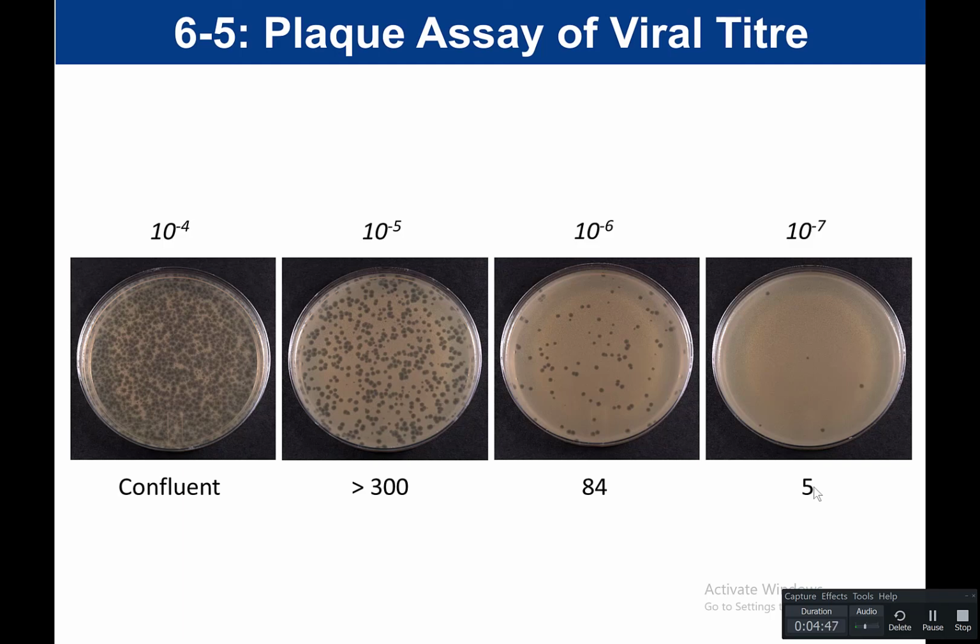If given a question like this on your exam, the number of plaques on the plate will be labeled. You will not be expected to sit there and count the number of plaques. They will be labeled for you, just like you're seeing in this image here. You just need to know which plate to use and then how to calculate that titer. And so this now concludes our plaque assay.